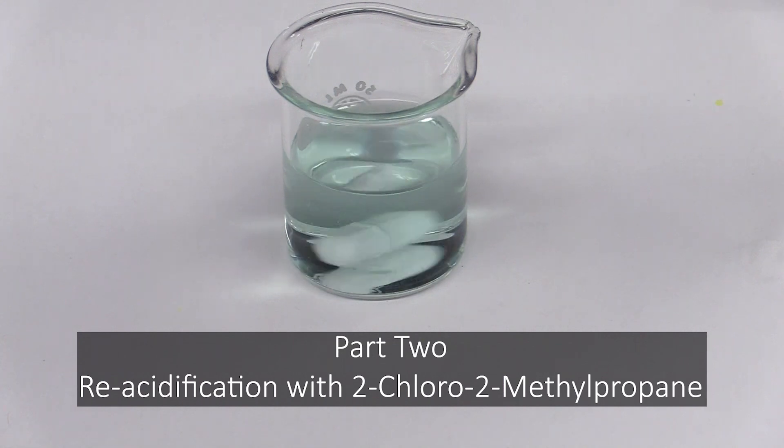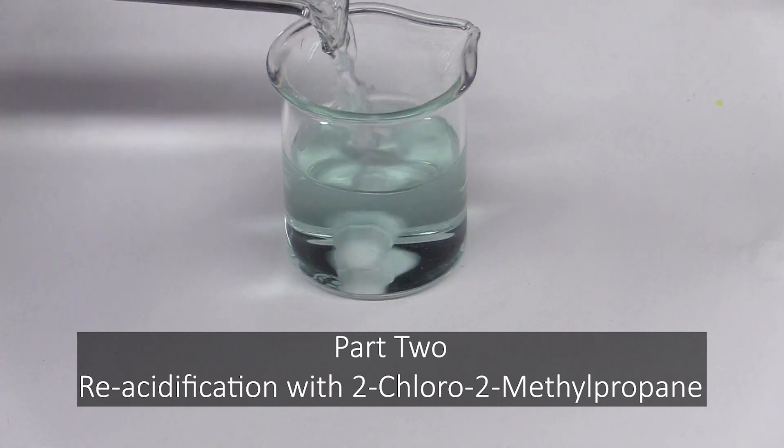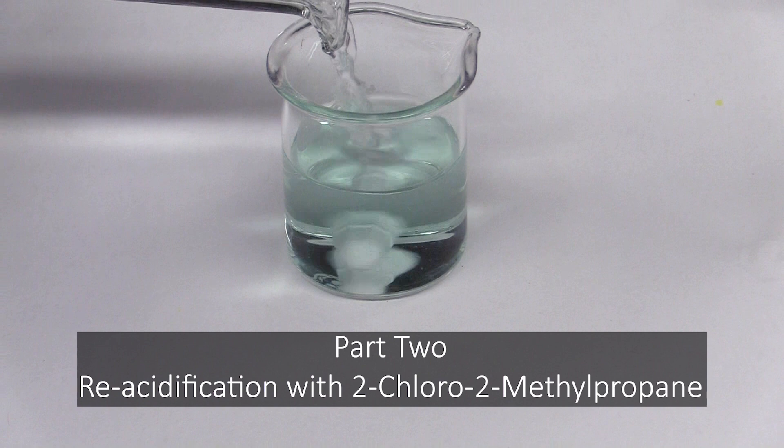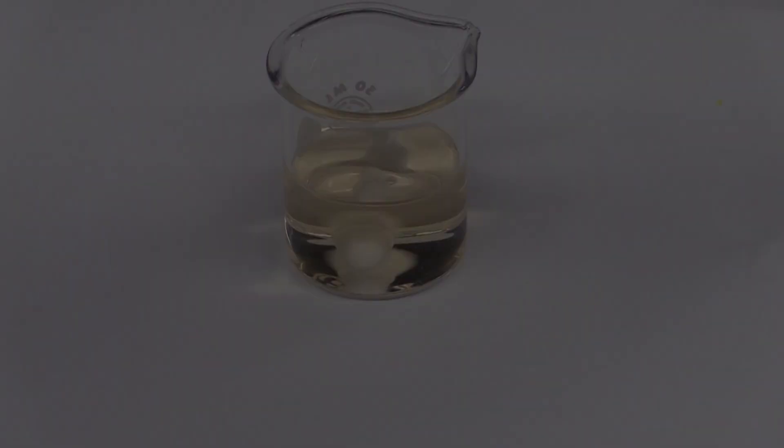All you have to do to start this reaction is add some prepared 2-chloro-2-methylpropane. You can track this reaction the same way you brought the acid solution to pH 9, that is, by monitoring the solution's color.